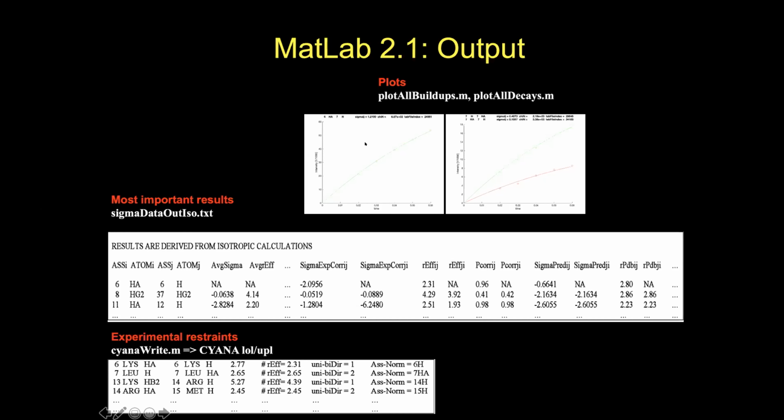If you have two NOEs, for the bidirectional NOE, where you can evaluate both cross peaks, both of the buildups will be plotted into the same file. That's the case here. That's a unidirectional one where we couldn't do that. You can open them in any kind of program, for example, in this viewer, and you can just scroll through them and kick out what you don't like.